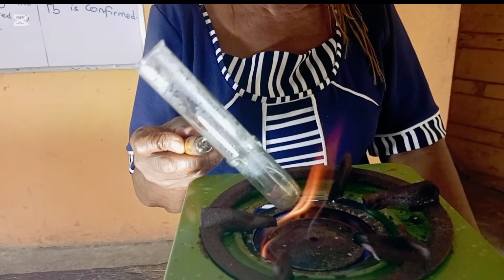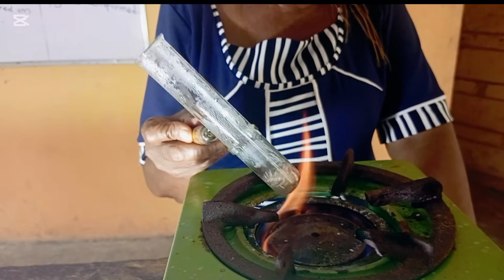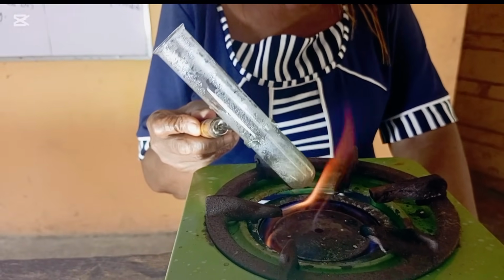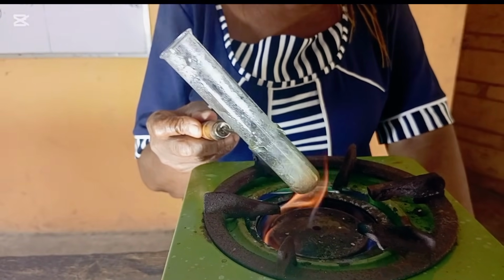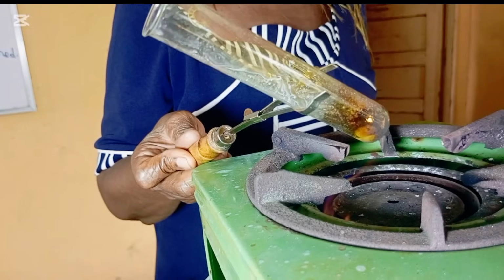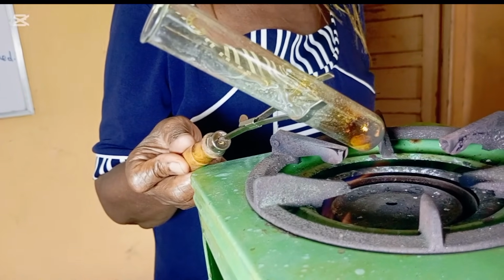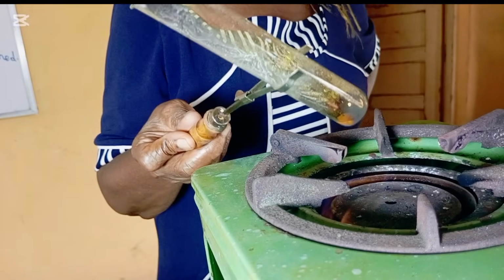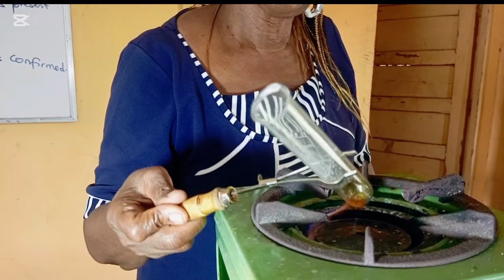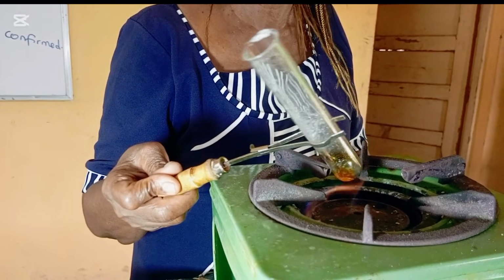Of course, that one is not necessary because you added water to sample C. So it's not a discovery. Observe the color of the test tube. It's turning reddish brown from the body of the test tube, and the gas is reddish brown in color with a pungent smell.